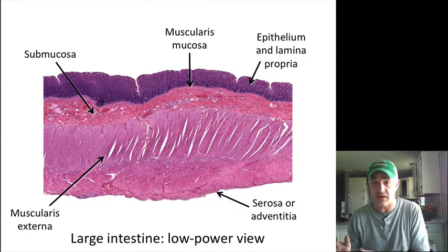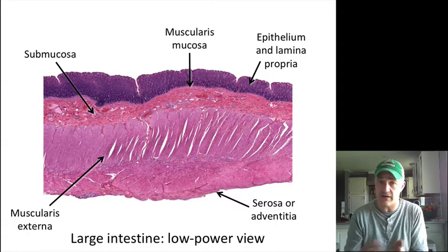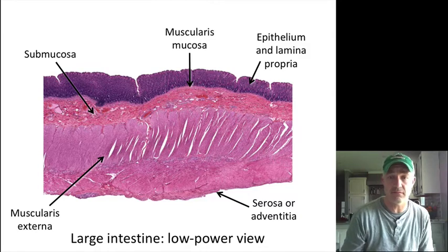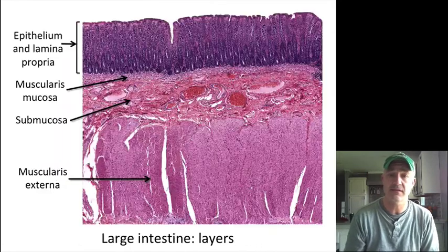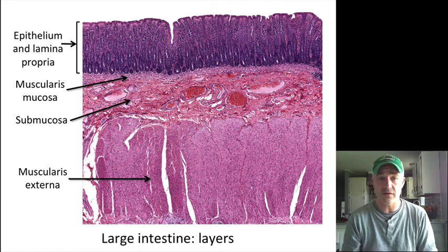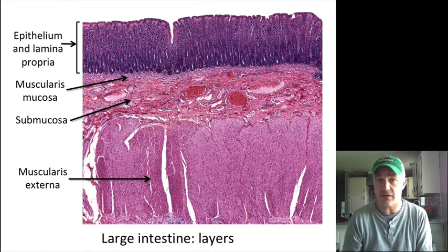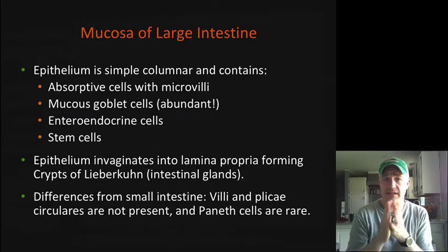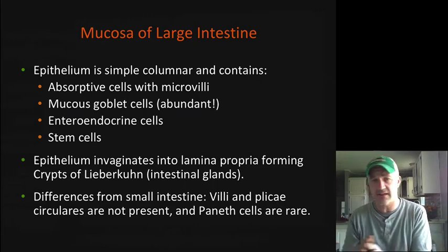As we're getting into the rectal area, we are going to leave the peritoneum, and it becomes adventitia again, without that mesothelial layer on it. As we zoom in a little bit more, you can see the mucosa and the muscularis mucosa on this one. Again, you see that there are not those finger-like extensions, not those villi going on there. There are some microvilli on these cells, but as we get further down, we're going to see less and less of that.